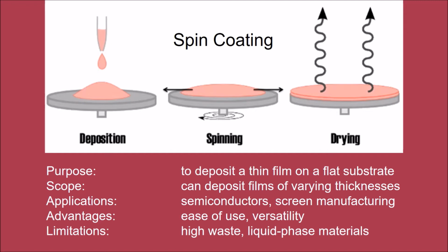One disadvantage of spin coating is that the actual material usage in a spin coating process is typically pretty low. Only around 10% of the material actually turns into the film, with the rest being flung off the side and wasted.